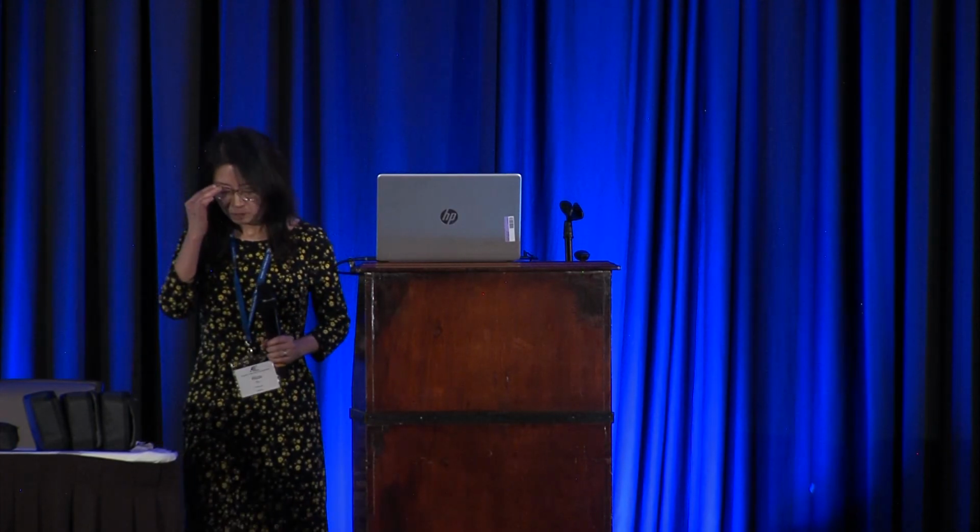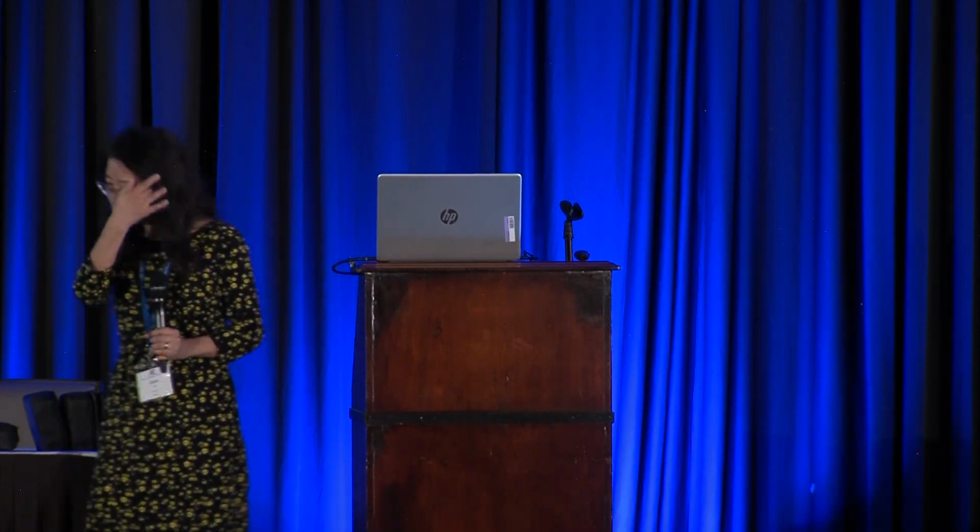Thanks for the great presentation, Alice. You indicated in your summary the customer needs, but perhaps you would be able to share what the biggest challenge is for a GC in those applications? So for biogas measurement, because it's so similar to traditional natural gas measurement, where GC has been so commonly used, there is really no real challenge.